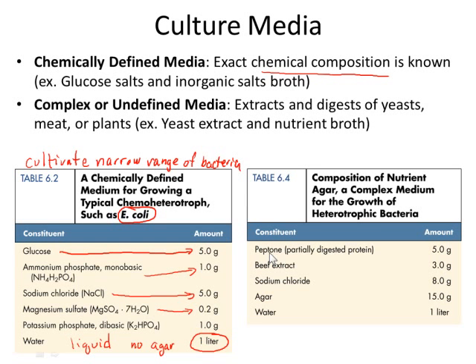As we break it open now, they are released into the environment. So for example, what it means to have a yeast extract is that we've taken these yeast cells, we've lysed them open, and all of the growth factors that yeast cell has to support its growth is now released, and we can use it to cultivate our own bacteria.